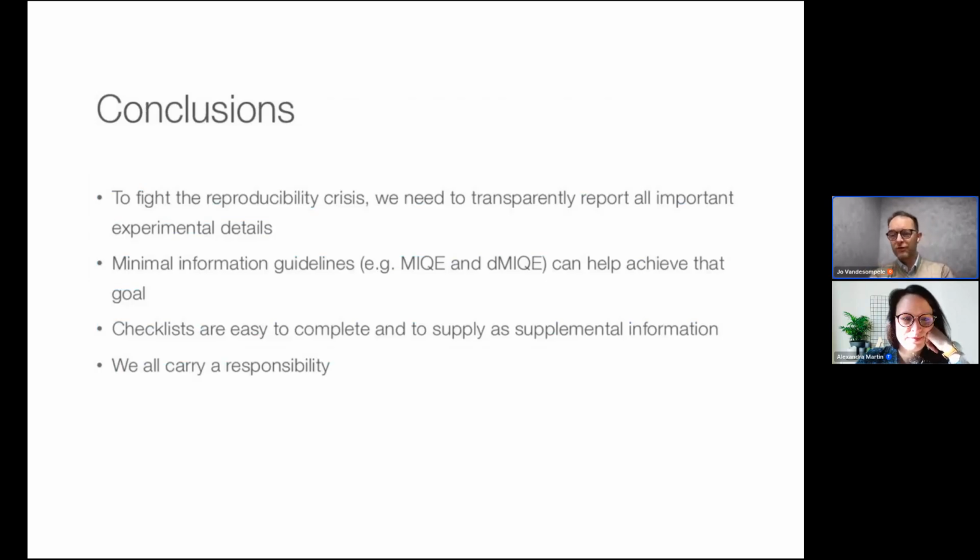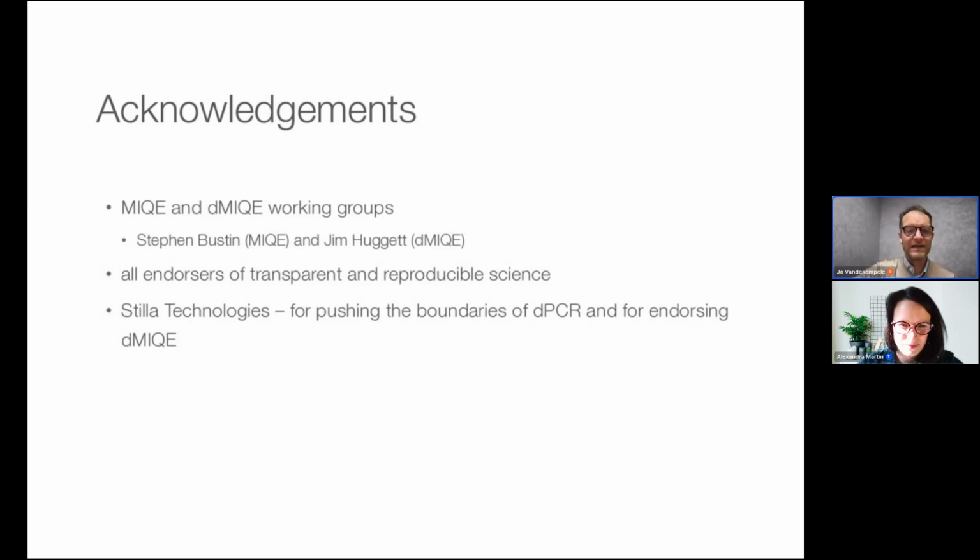So to come to the conclusion of my webinar, I think to fight the reproducibility crisis, we need to transparently report all important information. Minimal information guidelines like the dMIQE can help achieve that goal. Checklists are actually quite easy to complete, and you simply add them as supplemental information to your paper. And it's not about the others, it's about us. We all carry responsibilities. Which brings me to my final slide.